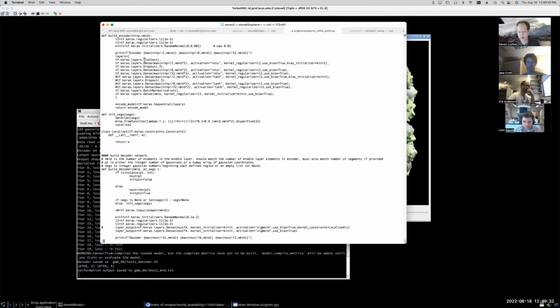It takes the input and first pre-processes the input. It flattens the input. So basically, if you give it m times 4 input values arranged in individual vectors, this will just turn it into a single one-dimensional vector object. And then we have dense layer, dropout layer, dense layer, dense layer, dense layer, dropout layer, dense layer, dense layer.